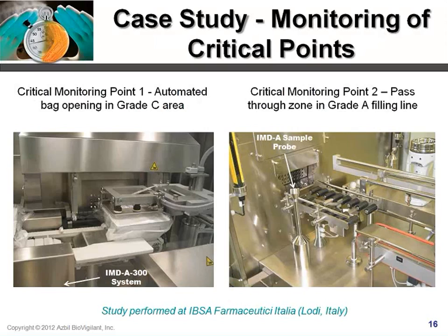So let's get into a case study. This case study was performed by IBSA Pharmaceuticals in Lodi, Italy, and basically IBSA used multiple IMDA systems to monitor critical points in a newly constructed aseptic fill operation during their initial validation.